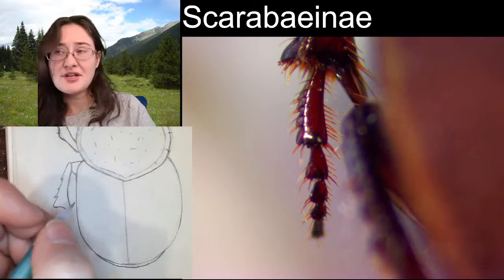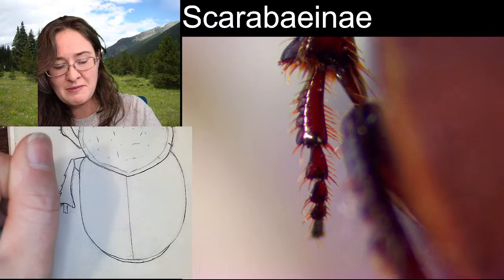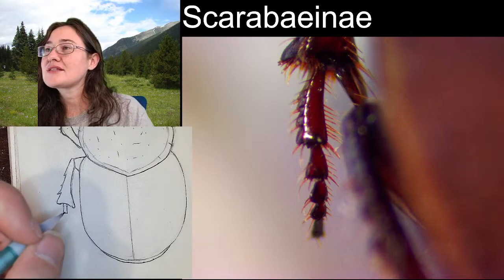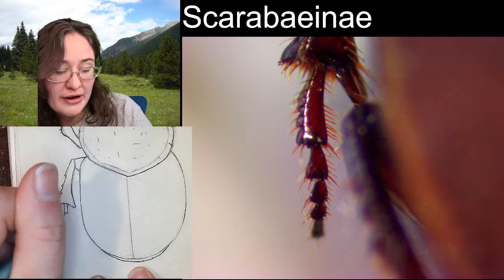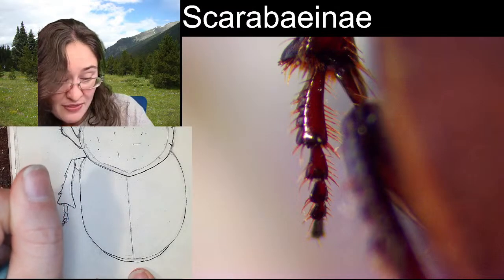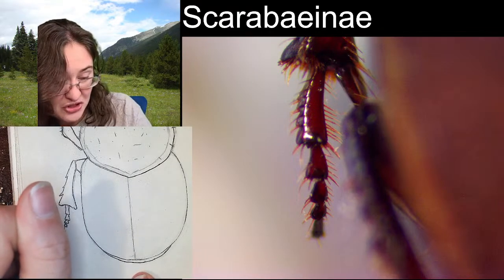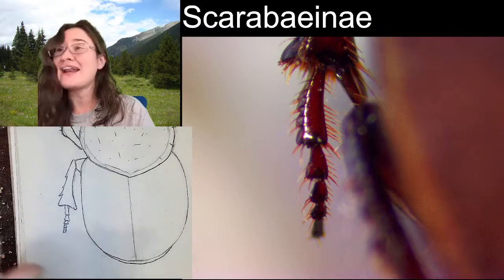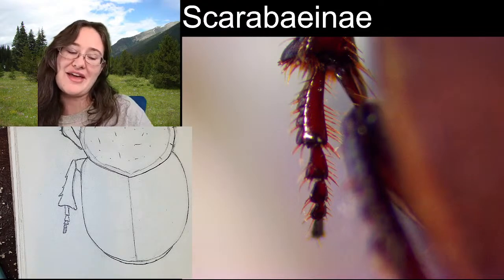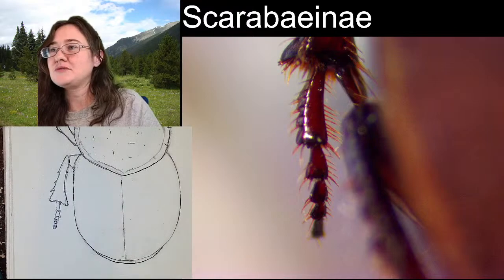All right. So our first tarsal segment is that nice long rectangle, but keep in mind we are pretty zoomed in. The next 3 segments look more triangular, like they could fit into one another, and they get significantly smaller until you get to the very end, which almost looks like a little peg leg. And I can imagine that if you're walking on the top of your middle leg like that, if you were actually rolling dung, that might be helpful.